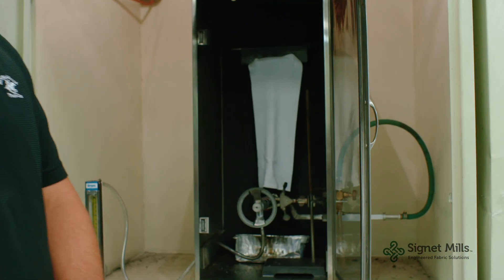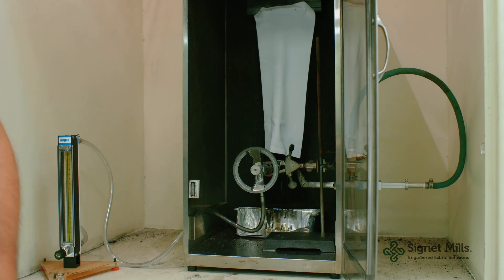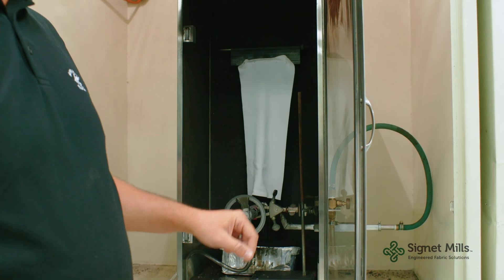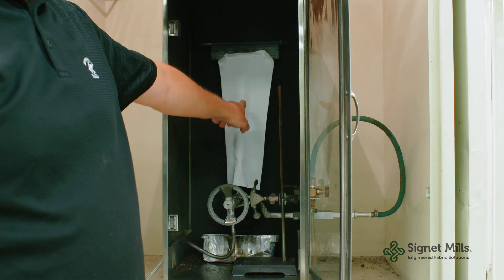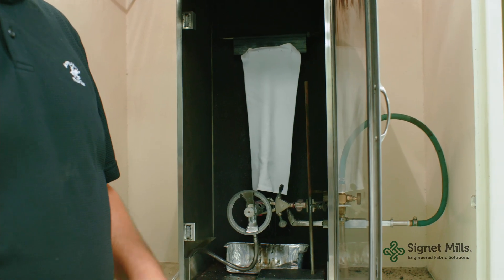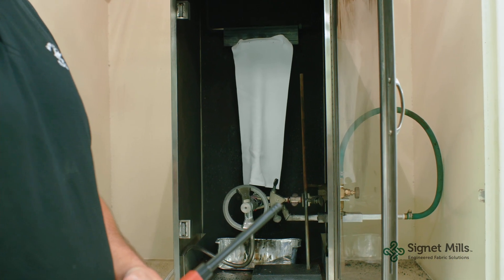In this test, a four-inch flame for 45 seconds is added to the fabric. We burn it. After the burning is over, we're going to measure the char length, the drips, and if the fabric continues to burn after the flames release, we're going to measure after flame.